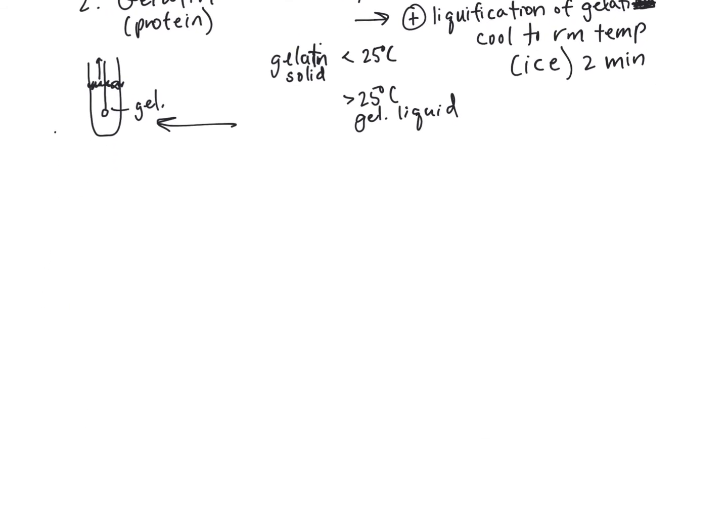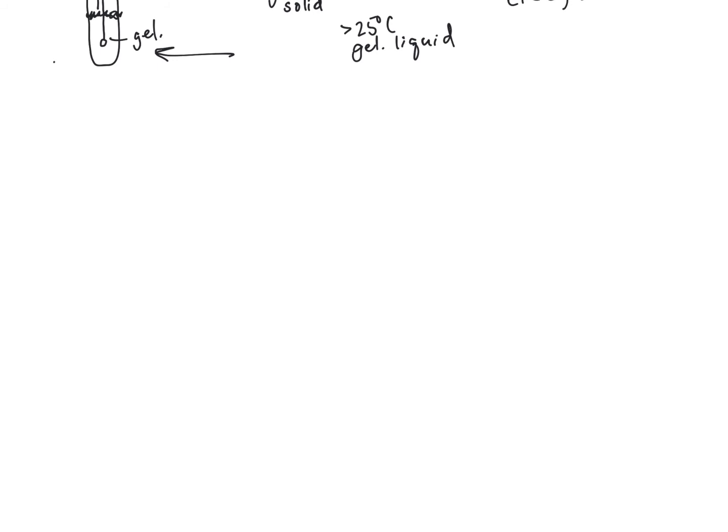All right, next up here, we're looking for an enzyme that breaks down starch. It's an enzyme that we have in our saliva as well, alpha amylase. Remember, starch is a carbohydrate, and it's actually made of many, many molecules of glucose put together. So if we're chopping up that starch, we're looking for short chains of glucose. That's called dextrin.